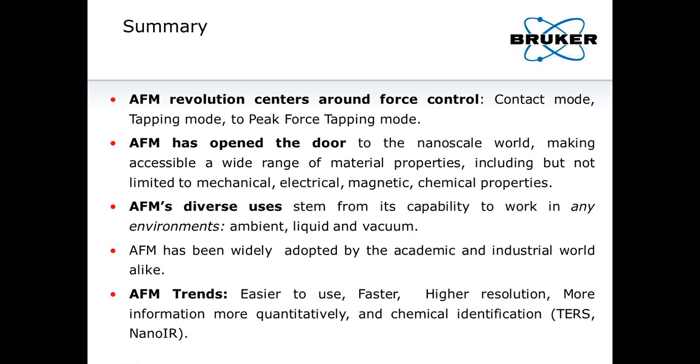Another question on electrical measurements: can we also measure the polarity of a material using a conductive tip? Are there AFM modes for such a thing? I assume this refers to electrical polarization or electrical charges, or maybe the polarity of the dopants, although I think we addressed that with scanning capacitance.